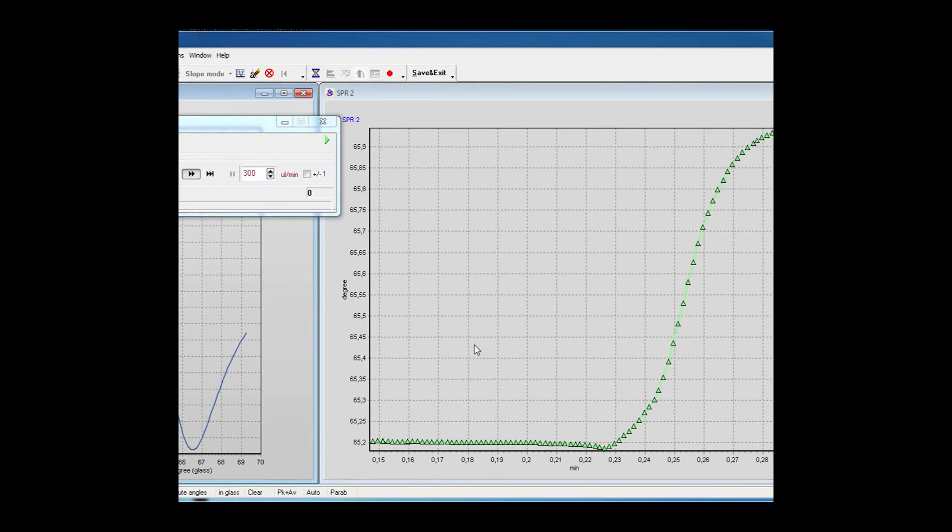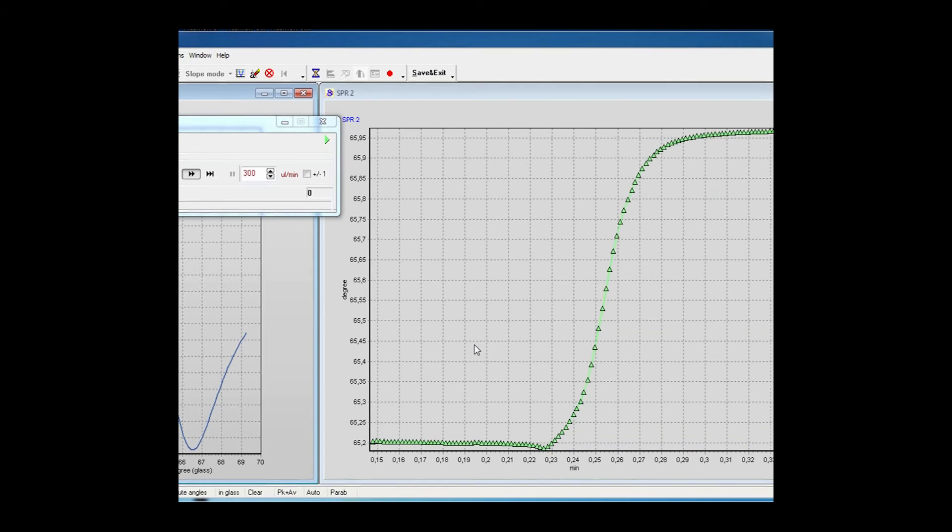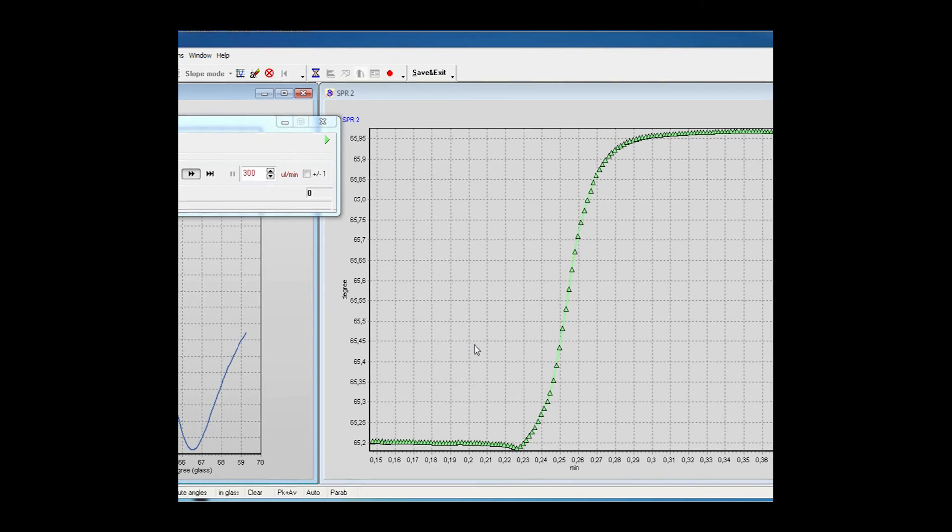This is a real-time view. As you can see, we measured hundreds of data points in just a few seconds.